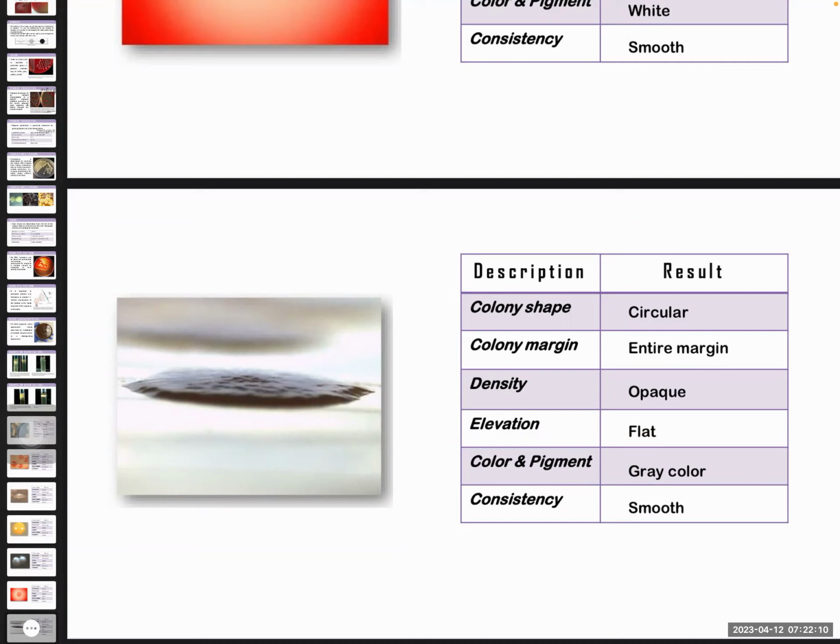What can we tell or what would be the characteristic of the organism pag medyo mucoid? If you can still remember, pag medyo mucoid yung colonies or basa-basa, that is an indication that the organism is capable of producing capsule.